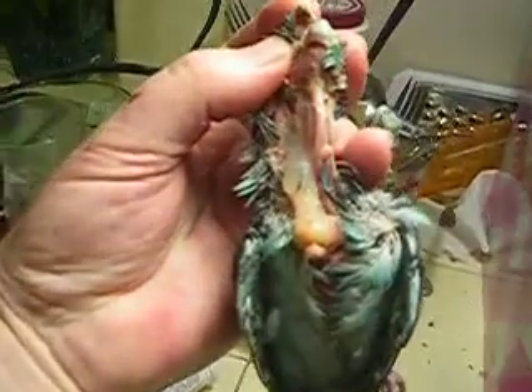This is a little linny. I've exposed his chest here. You'll see on the right-hand side this is the trachea — it brings the air into the lungs — and on the left, this is the crop.